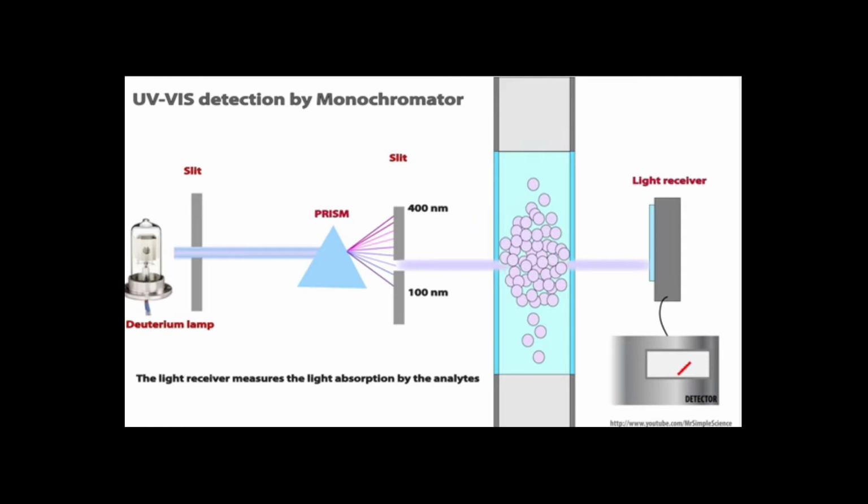As the analytes shine through the photodiode array, the light is shown through the window and on to the analytes. On the other side of the window is an instrument used to record the light that the analytes absorb. Knowing at which wavelength the analytes absorb light is useful because each individual compound will absorb light at different wavelengths.